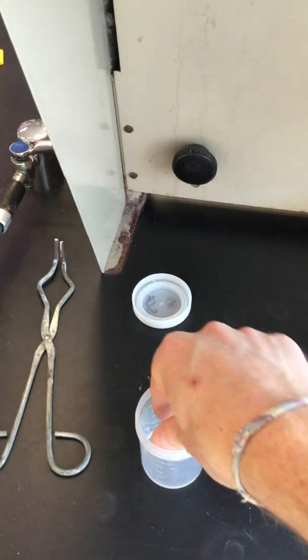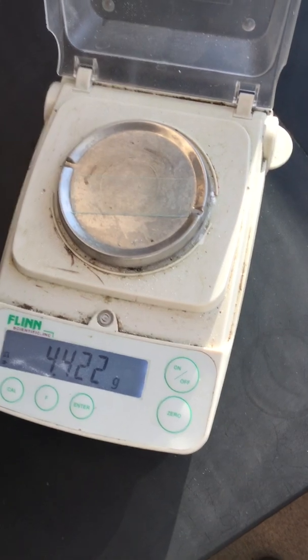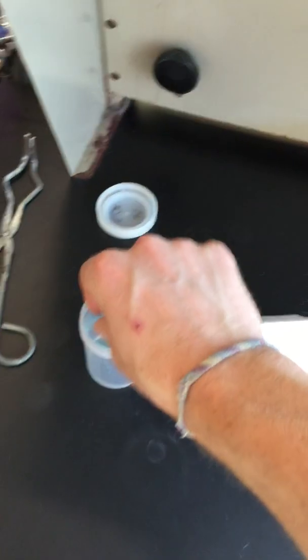And if you've paused and come back, here's what I did. I weighed that piece of glass. And when I weighed said piece of glass, you can see that it has a mass of 4.422 grams. All right, let's jump on to station 3.